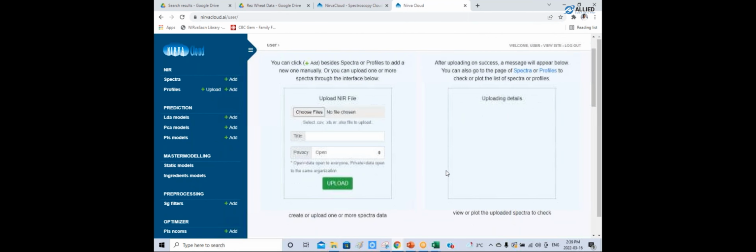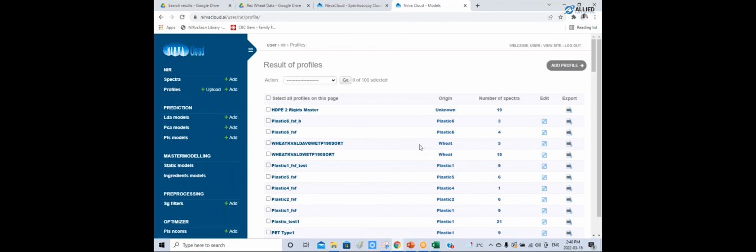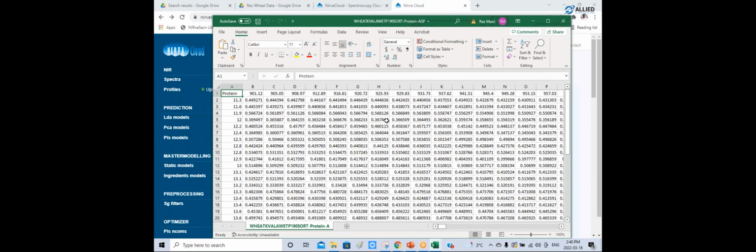Once you click on analysis, you'll see all the different features that appear in here. So you can put your spectra there. These are all different spectra, but normally the way we do it is that we upload profiles, and this is what the first page also showed us. So upload profile. What do I mean by that? What I mean is that you make a profile, just like in that Heather Brooks page that I was showing, how she set up the spreadsheet.